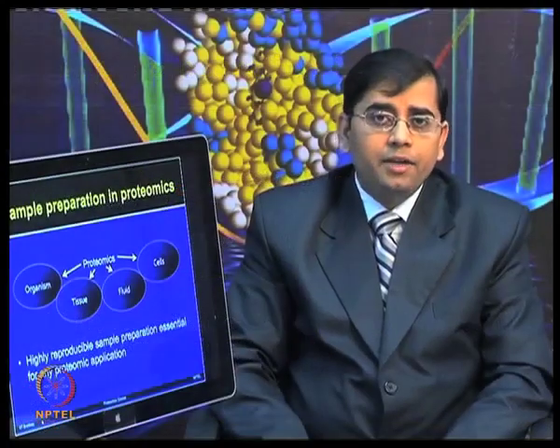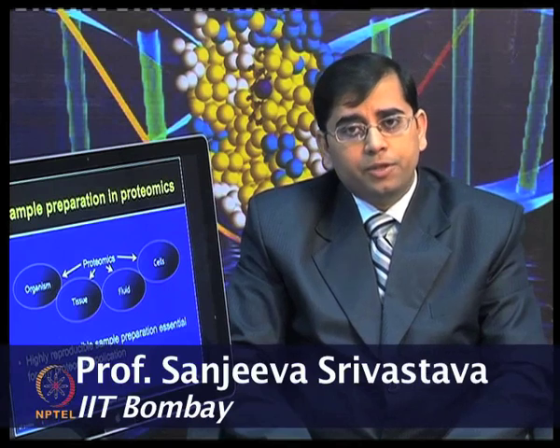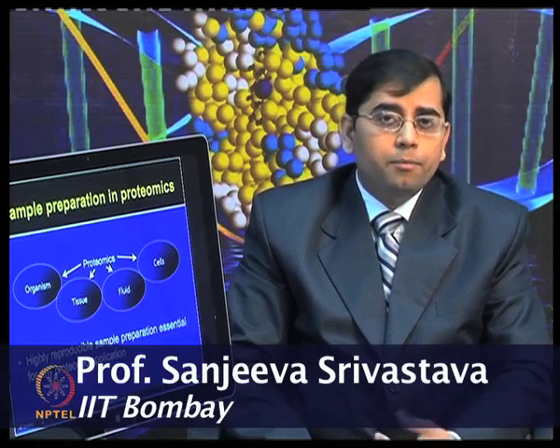Proteomics can be global or it can be very targeted or expression based. So, highly reproducible samples are very important for performing comparative proteomic analysis.